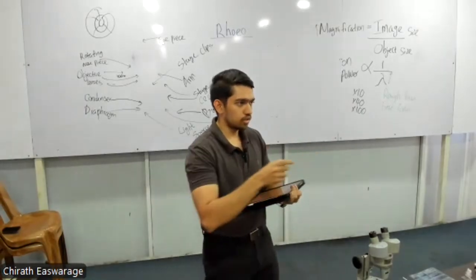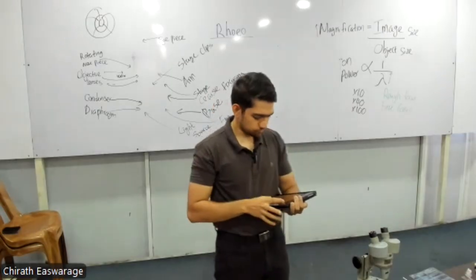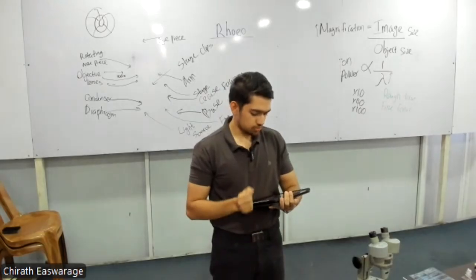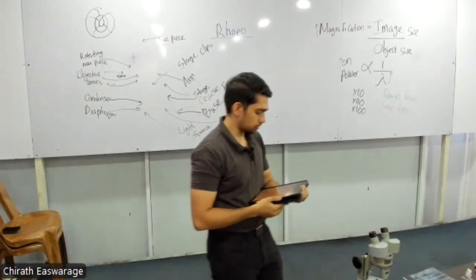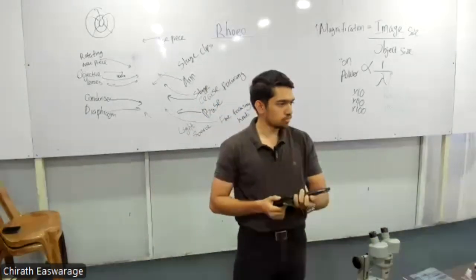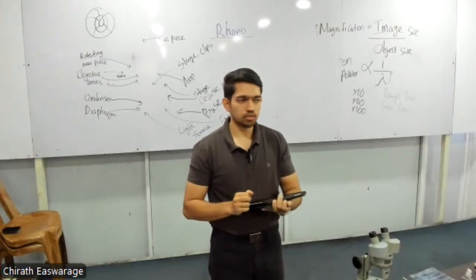If you have a cell, you shoot electrons through it, then you can see the inside. The beam of electrons is passed through a thin, specially prepared slice of material. A very thin specimen is used, and the specimens are stained with heavy metals which attach more to certain cellular structures than others. I'll show you some images so you can see this staining with heavy metals.